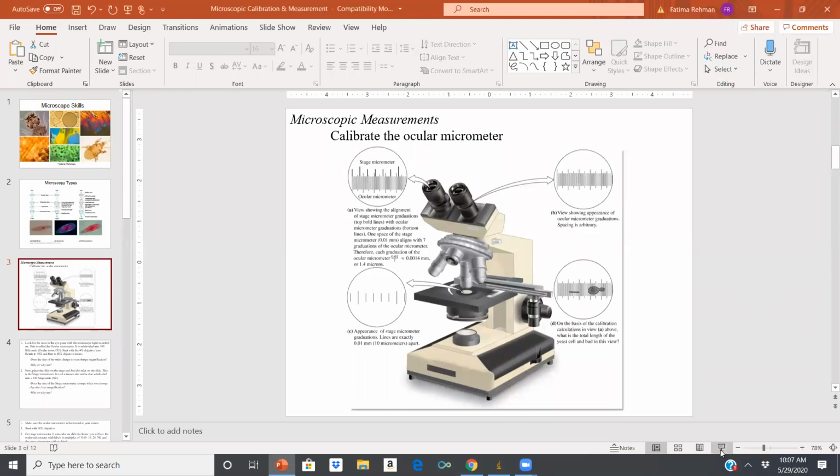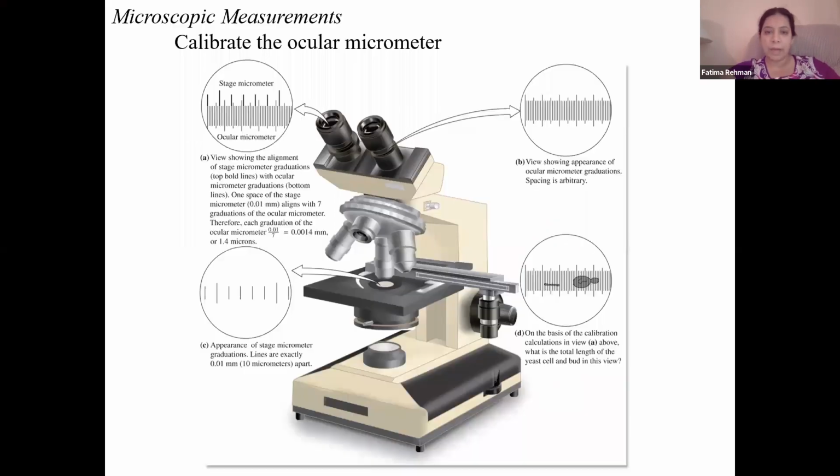Yes. Perfect. Okay, so we're going to start off by reviewing parts of the microscope. For this one, I am assuming that everyone is familiar with microscope parts, so you guys should be able to just shout out the names or write them out. So let's start from the top. What are these lenses on the top called?